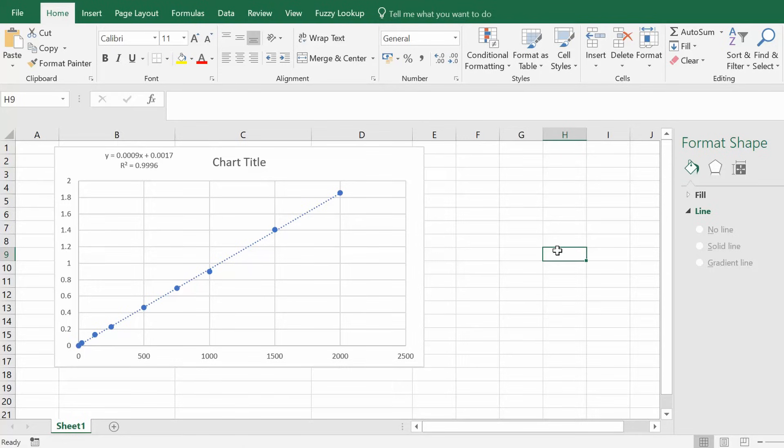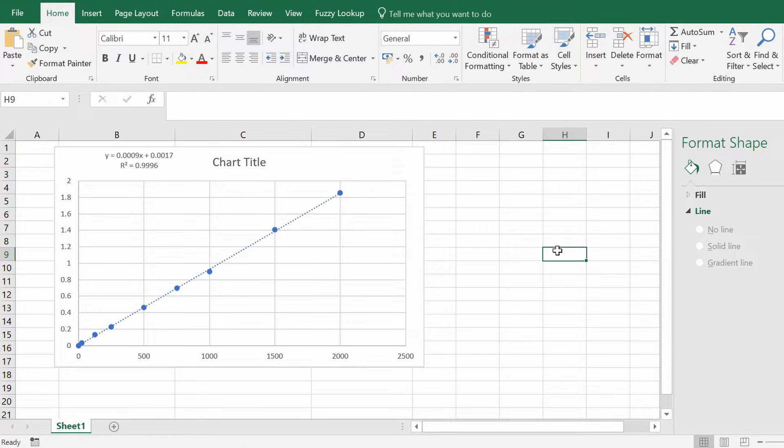In this video tutorial, I'm going to show you how to create a linear standard curve by using Microsoft Excel.